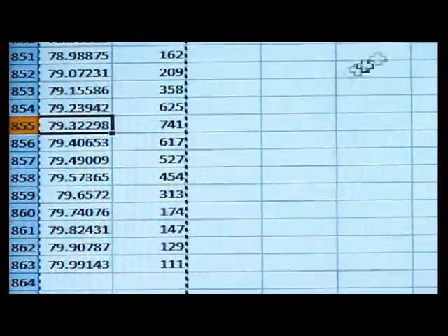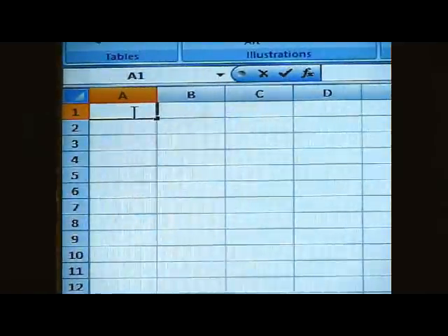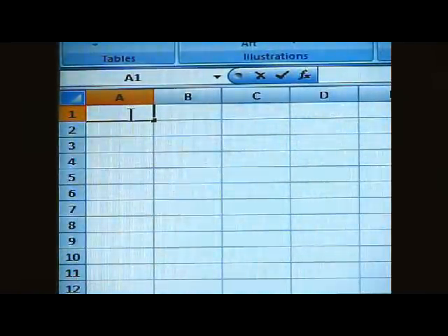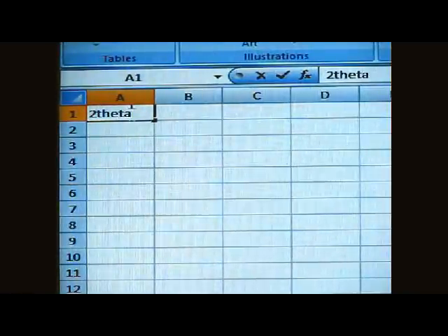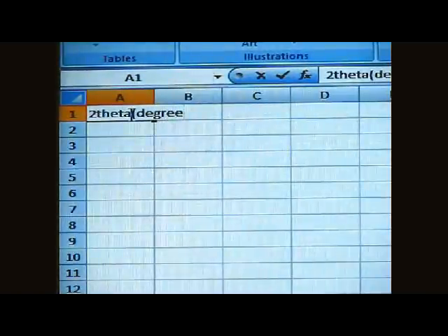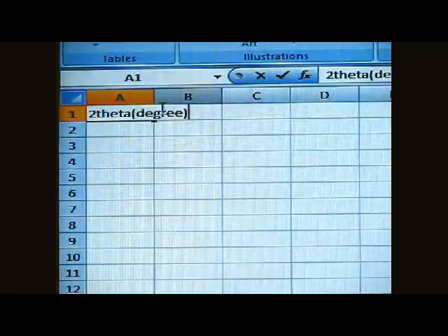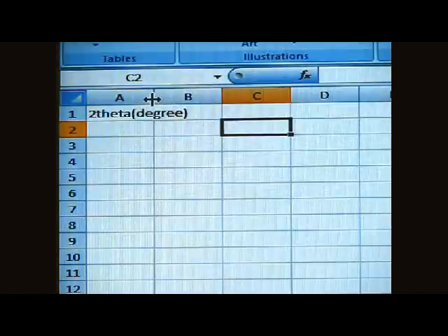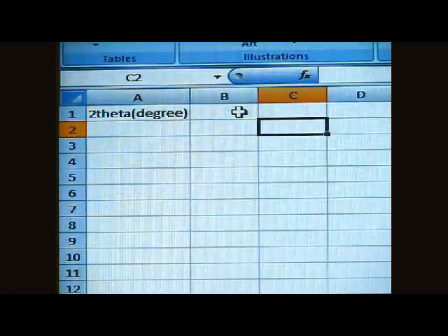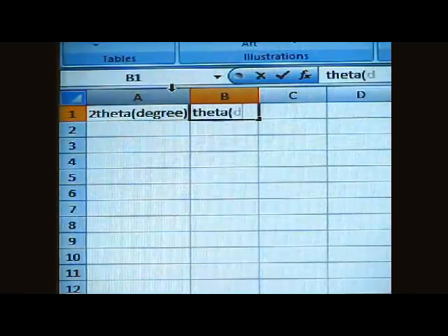Now we have to tabulate the given data. So open Excel. And first row, we write it as 2 theta, which is in degrees. In the next column, it is theta in degrees.